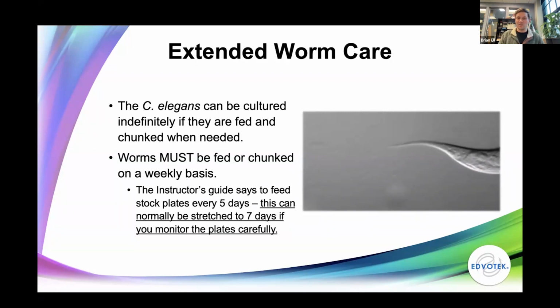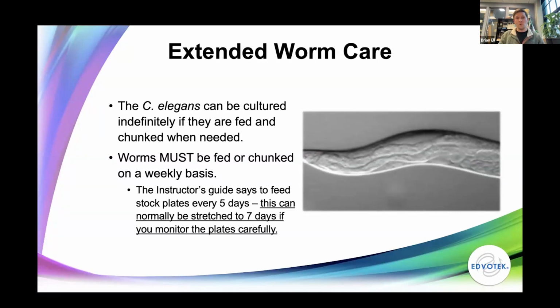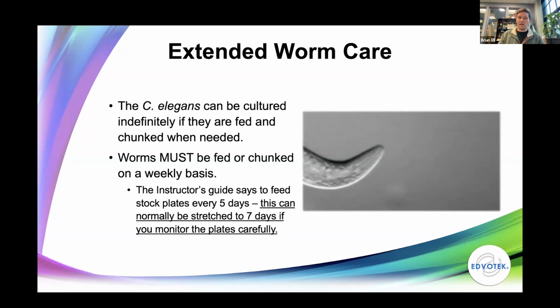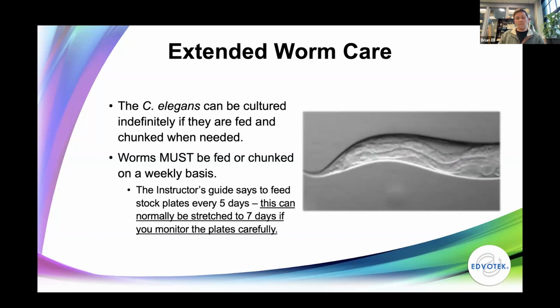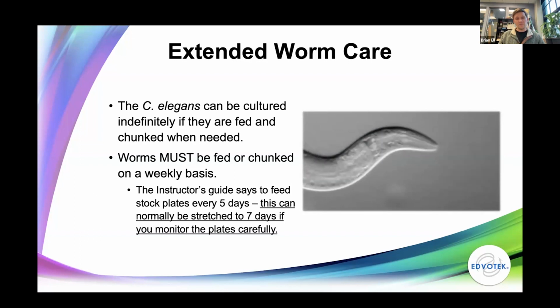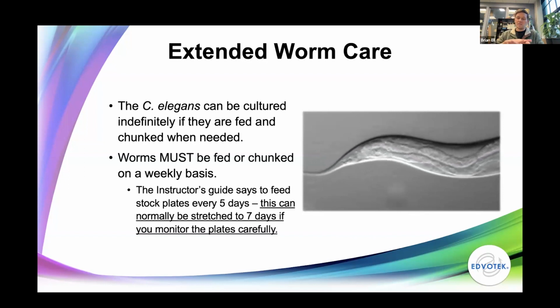So that last day that you are in the classroom, make sure that the classroom is not going to get too cold or too hot. I know a lot of schools will turn down the heat, and as long as it's above 16 degrees Celsius, the worms are going to be happy and fine. So we feed them or chunk them immediately before we leave. We make sure their plates are not going to dry out, so they're inverted upside down, which helps to keep some of that moisture inside, and then just leave them be.